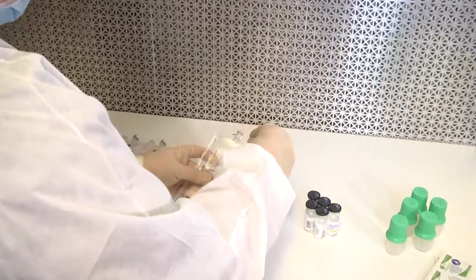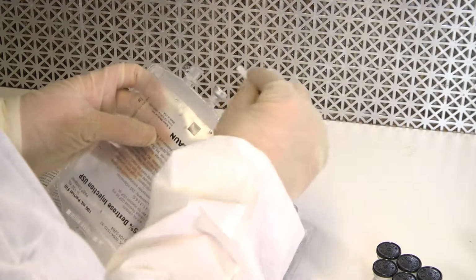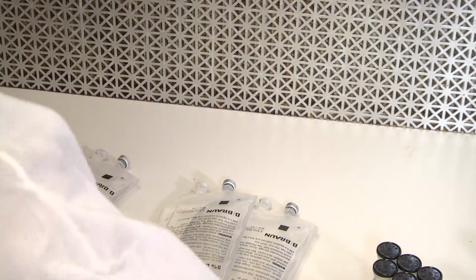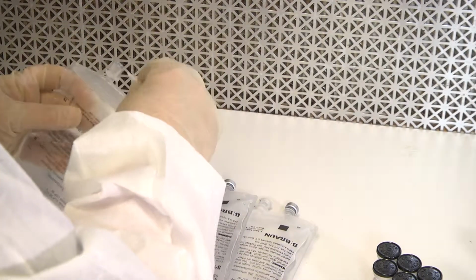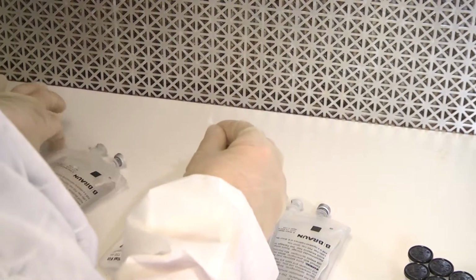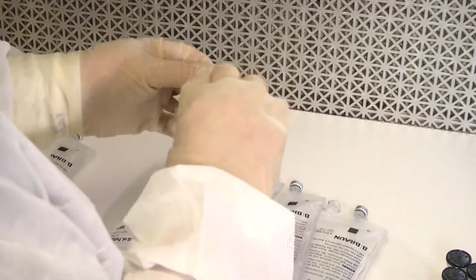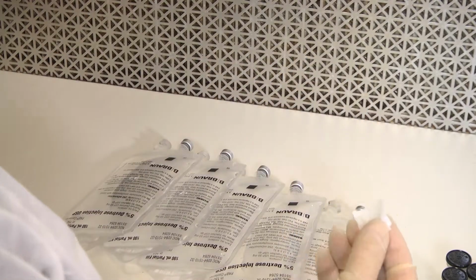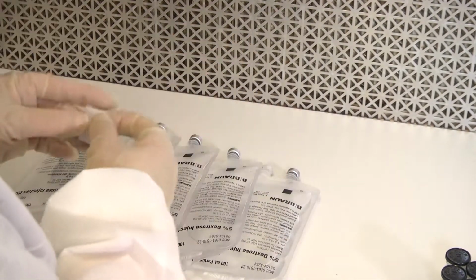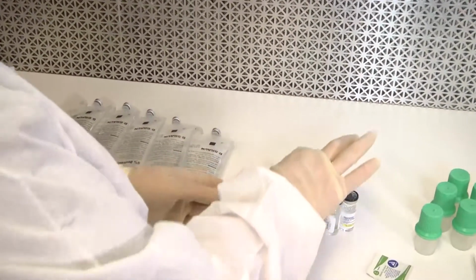And then discard that alcohol swab. Now take another alcohol swab. It's very important to clean the tops of these because the dust cover really doesn't keep all bacteria away from the IV. Have one left there. So now my IV bags are clean. They're in the flow of the air of the HEPA filter. It's good. Now I'm going to get my vials ready.